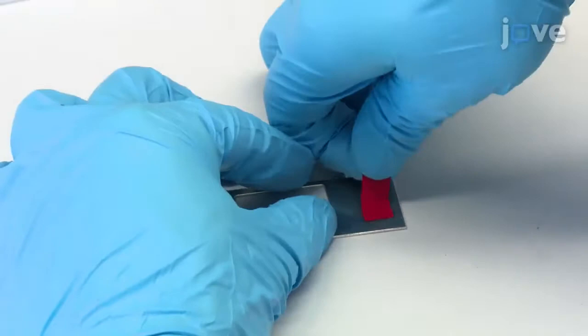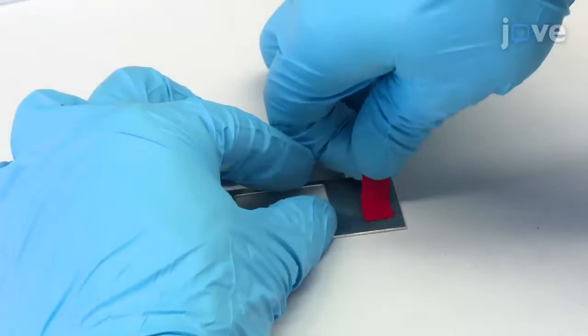Next place a sterile glass cover slip on a plastic or metal frame that has a hole in the middle. Then use tape to fix the cover slip to the frame.